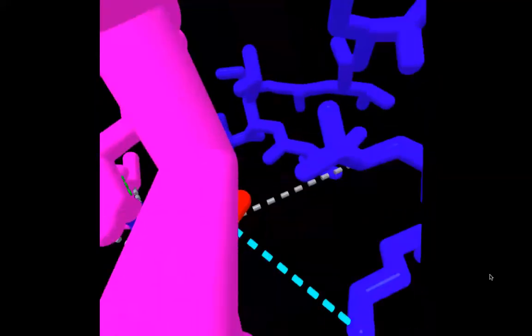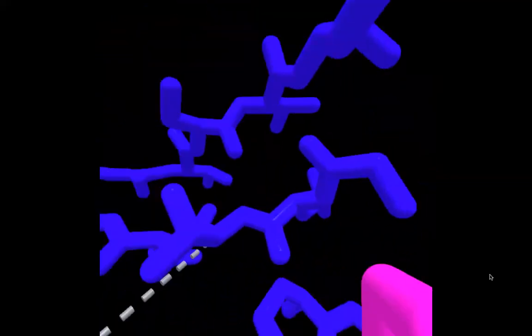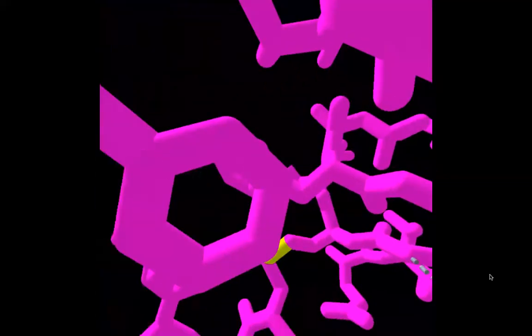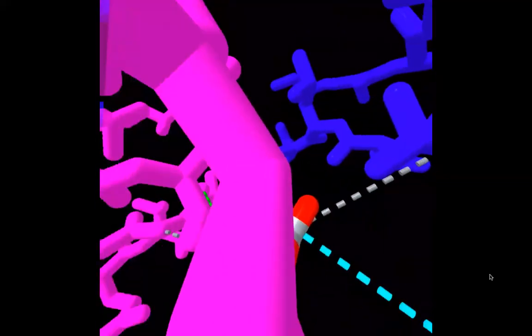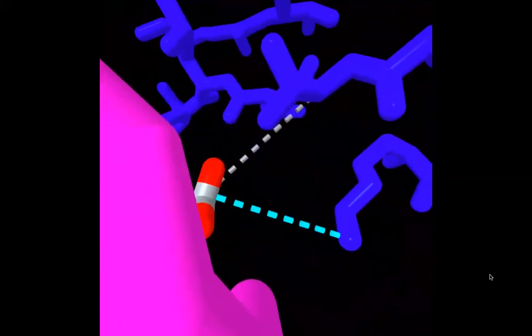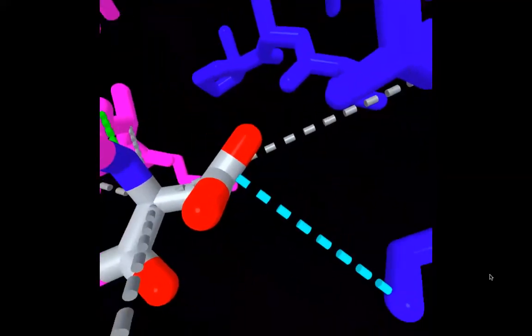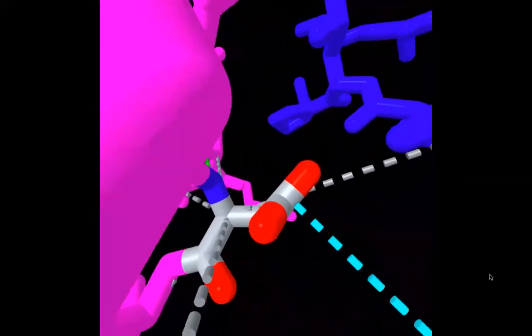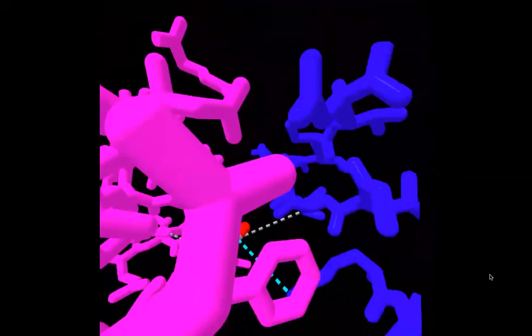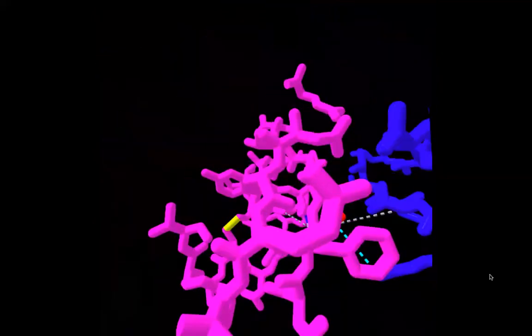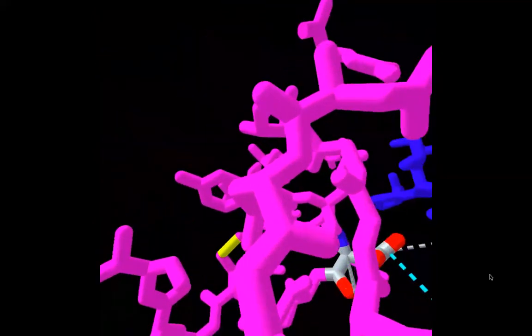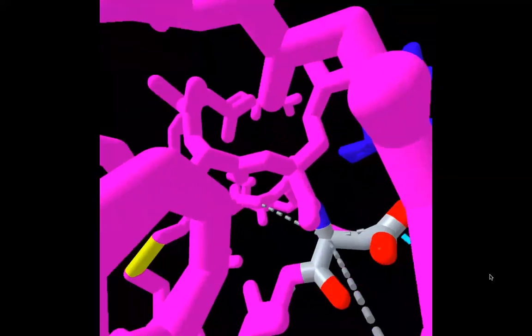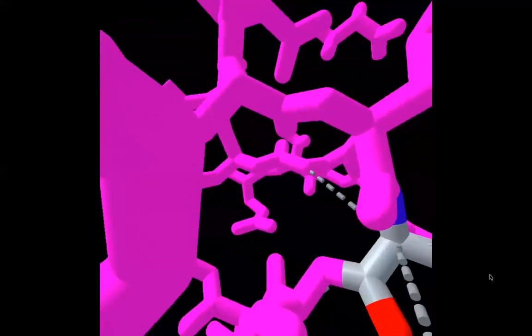Now you are viewing the interactions between actually the mutant and wild-type. So you can go forward to see, for example, this salt bridge, and you can go backward, and you can go to another place, focus on different angles, check the interactions.